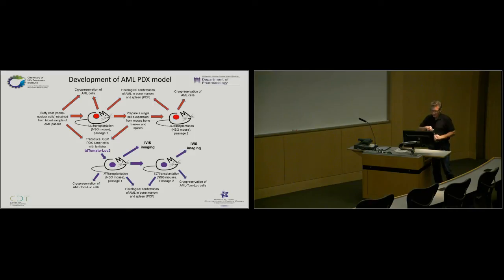So the second type of model that we do, we're doing a lot of leukemia models, and we can get either biopsy tissue or other types of bone marrow samples, or we can get peripheral blood, and we can get spin down cells. In this case, for leukemias, we'll inoculate intravenously, and these cells will actually home to the bone marrow, and they'll establish shop in the bone marrow. Again, you can label them, you can try to follow them, although we have not had a ton of success, for whatever reason, given the labeled cells are hard to see once we get into the bone.